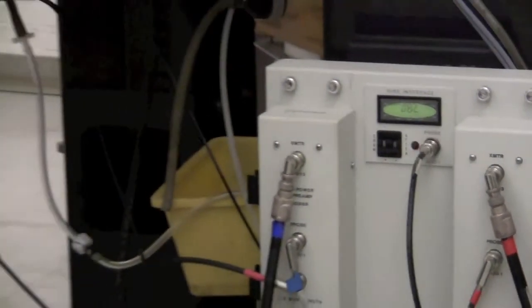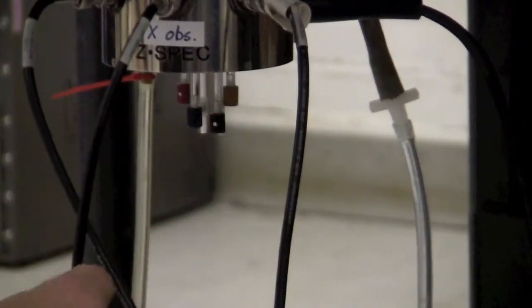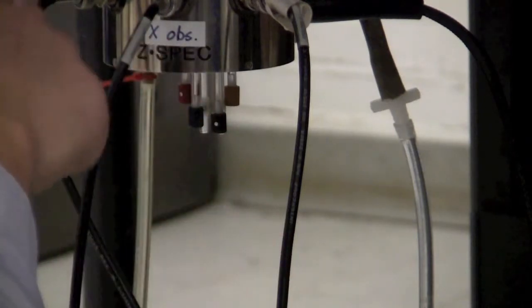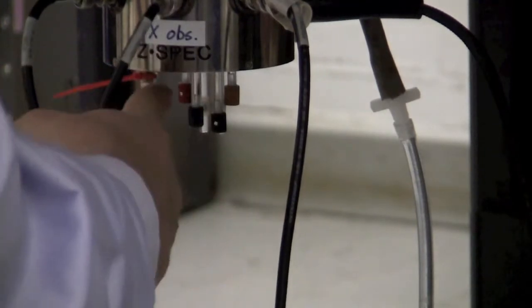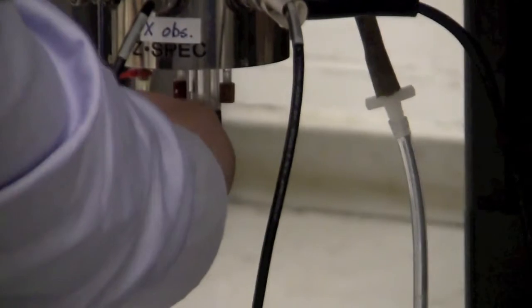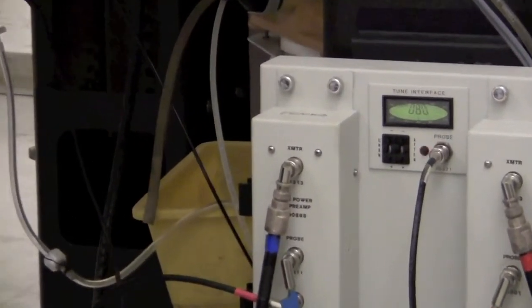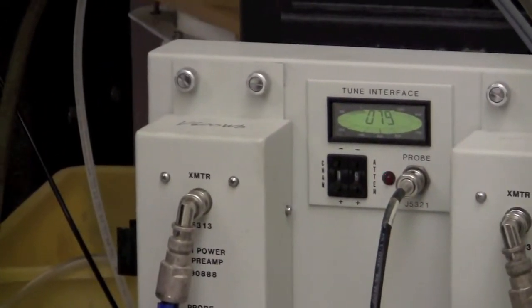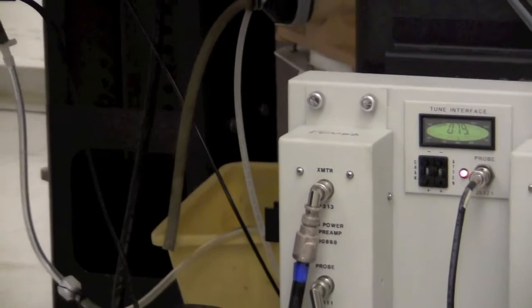To tune it, adjust the knobs on the probe. There are two sets of knobs: one side is tuning and matching for protons, the other side for carbon. They are labeled XTNM and HTNM at the bottom of the probe. Start by adjusting the matching knob and look at the tune interface to minimize the number. Adjust in the direction that makes the number smaller, find the minimum, then turn the tune knob in one direction.